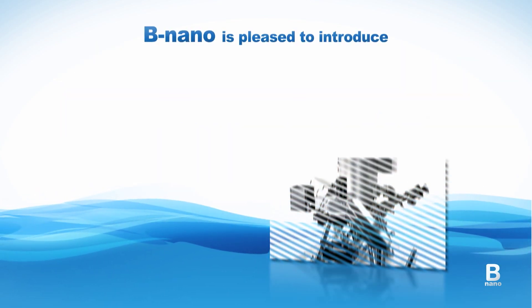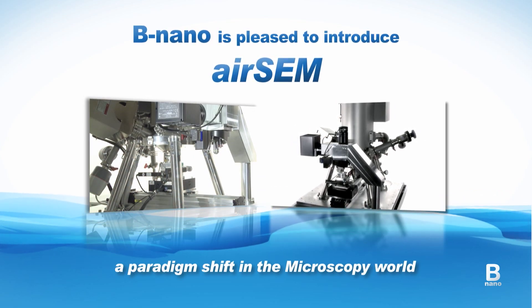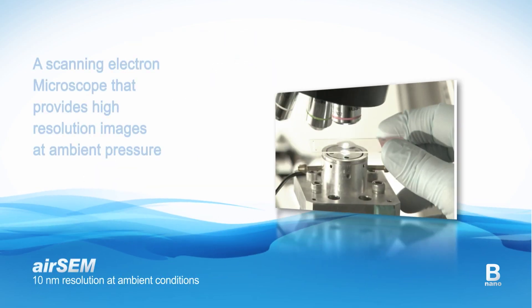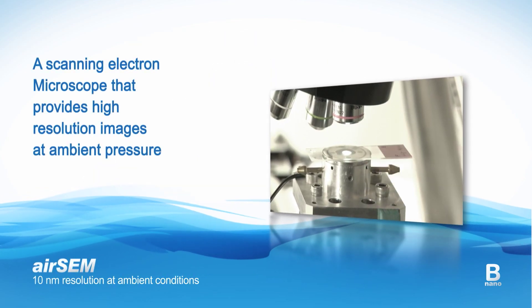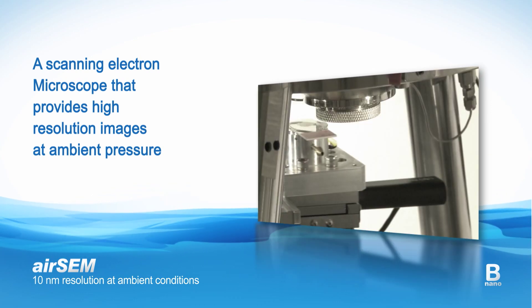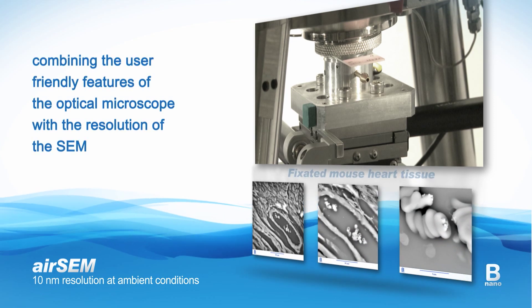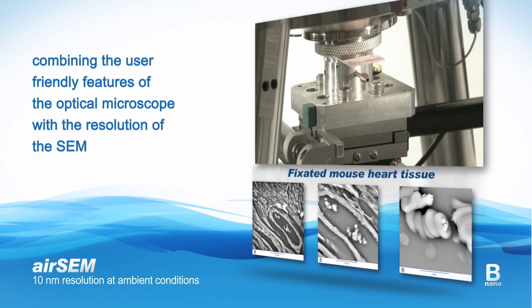BNano is pleased to introduce the airSEM, a paradigm shift in the microscopy world. BNano has challenged current practice by creating the airSEM, a scanning electron microscope that provides high-resolution images at ambient pressure, combining the user-friendly features of the optical microscope with the resolution of the SEM.